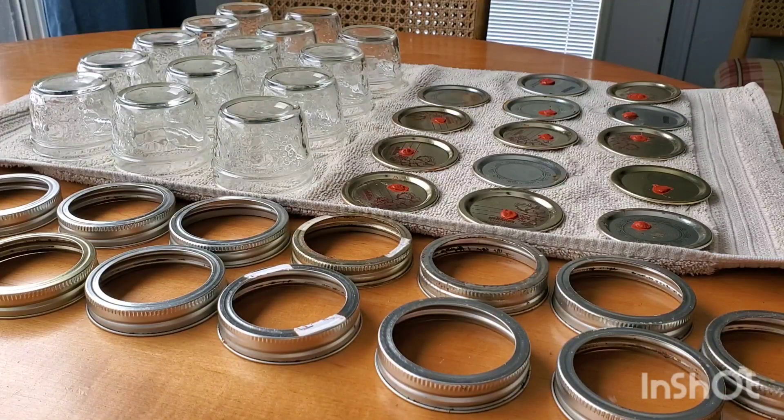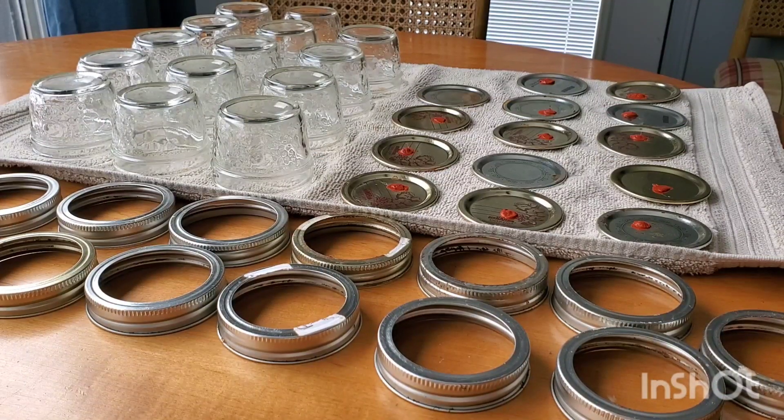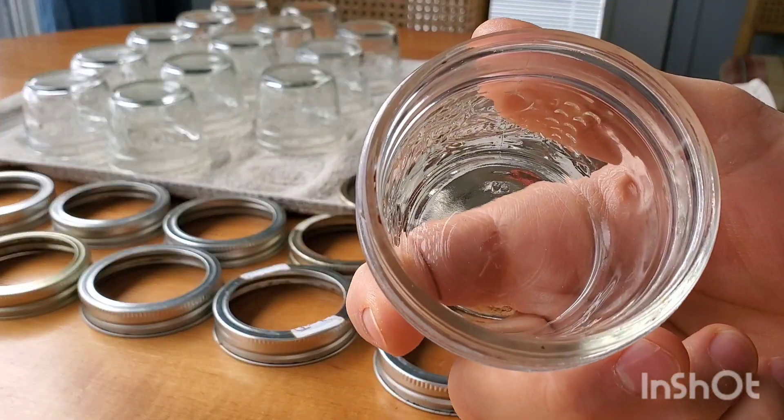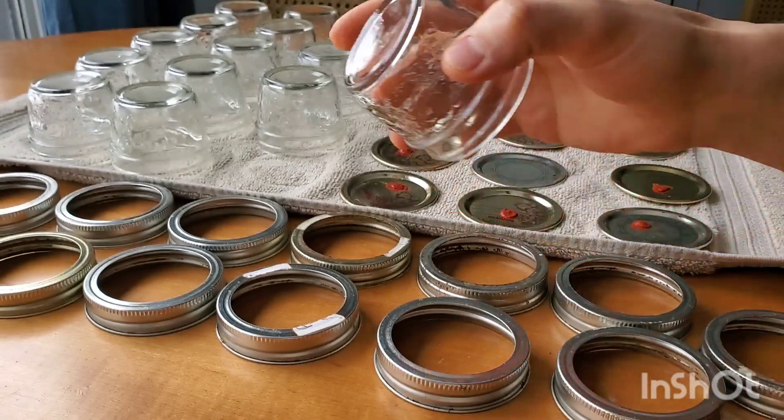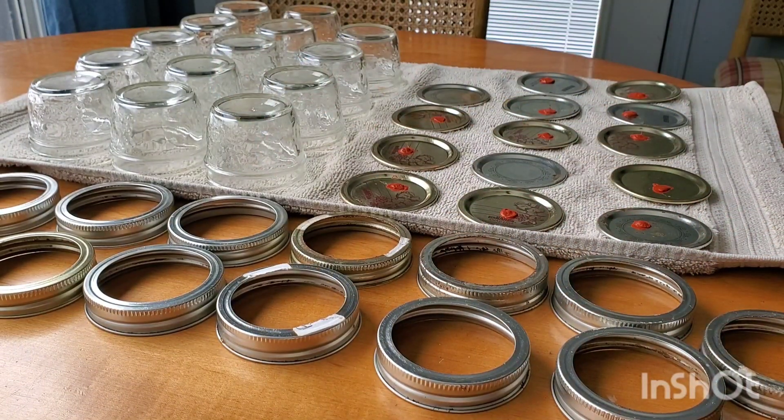Now everything's cleaned. We've disposed of our used agar and washed the jars and the lids in the sink with soap and water. Everything looks great and is ready to be reused. You can pretty much reuse these indefinitely.